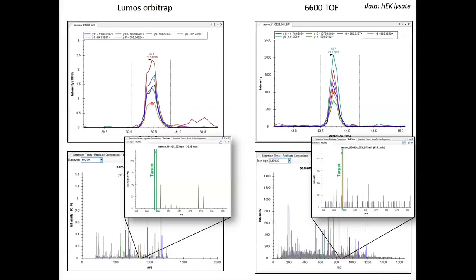Both are nice signals. But then if you extract the decoys, which correspond to the y8 in the reverse sequence, the decoys basically get nothing from the Orbi data because there is no noise, and the decoys get quite a fair amount of signal from the triple TOF data. All this impacts the pictures I showed you before. The Orbi data doesn't extract any false targets and extracts much fewer decoys, just because the data itself contains a lot less noise than the triple TOF data.